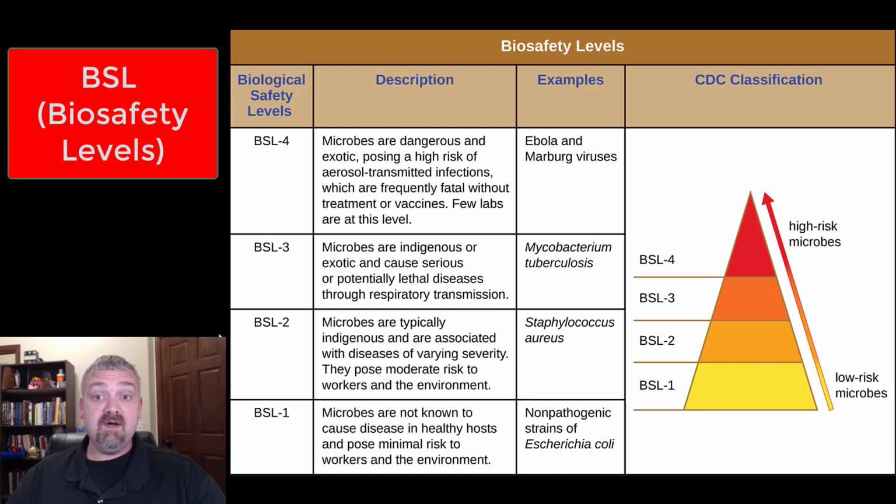The reason this is important in microbiology is because it determines what kind of precautions we need to take if we're working with certain microbes. Obviously in the labs that I teach we hang around in the BSL-1 and occasionally into the BSL-2 level, but I actually want to walk through each of these levels and give you a few more examples than the book does as far as the different levels.